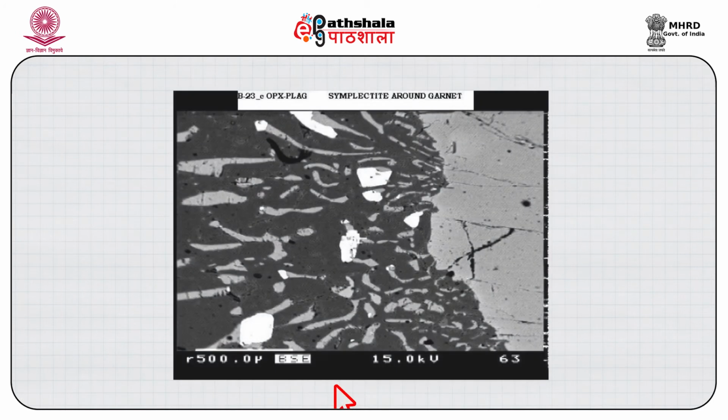Let us look at the images produced by backscattering as well as those produced by secondary electrons, because the SEM has the main function of microscopy. In this figure, which is a very interesting figure, one sees towards the right hand side a garnet which is breaking down into two phases, and these phases are orthopyroxene and plagioclase. This is a typical texture which is known as symplectite.